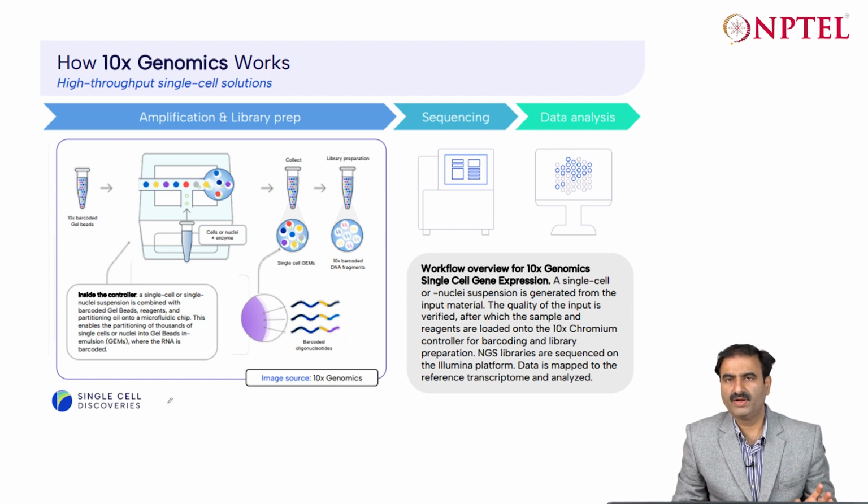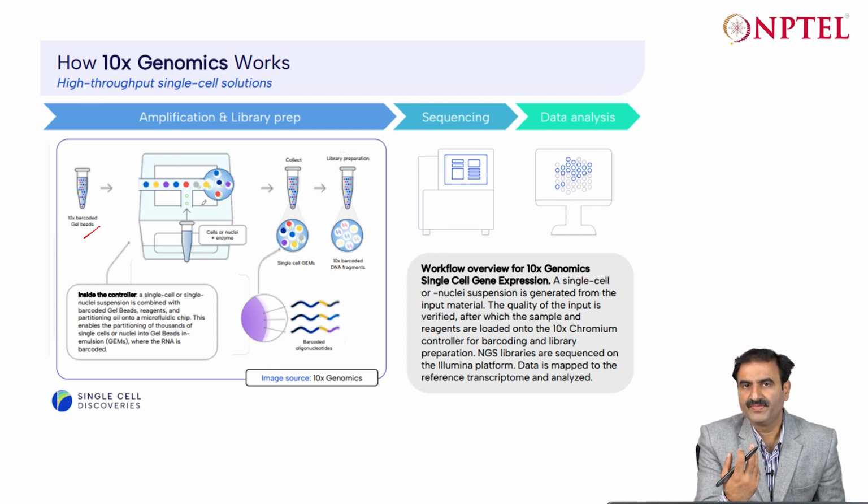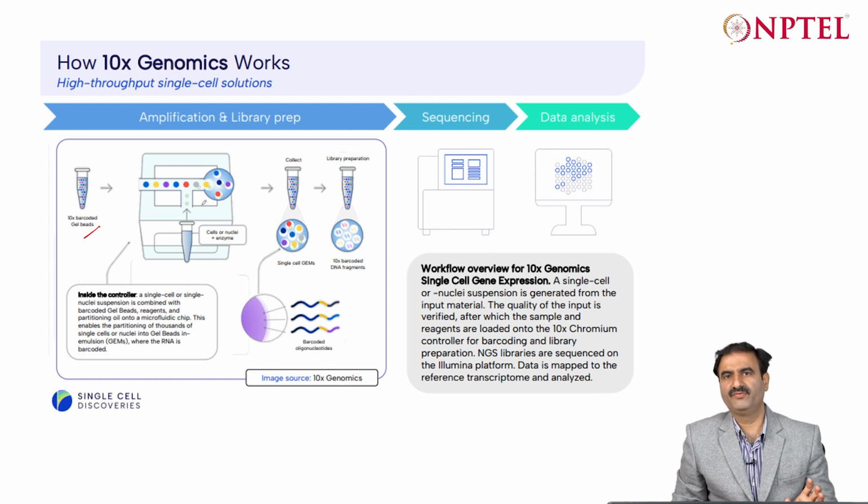Overall, to summarize, there are gel beads in which you attach the DNA and insert it into an oil droplet, in which you do the amplification, and then fragment the DNA. Each fragment is assigned the same barcode. There is a whitelist of barcodes which is compared by the scripts to segregate the fragments later.